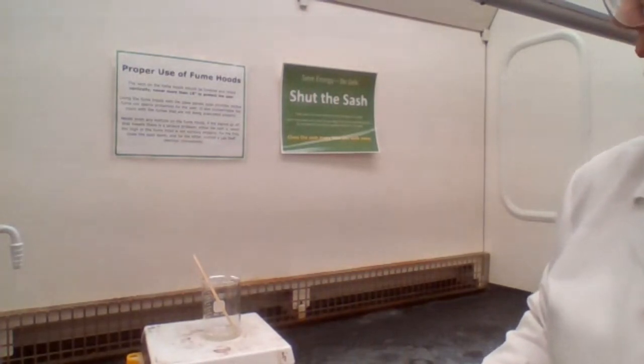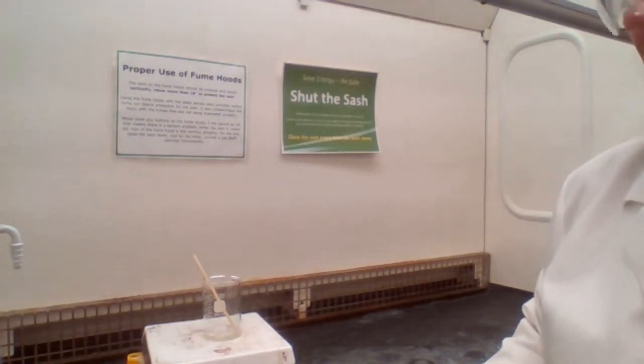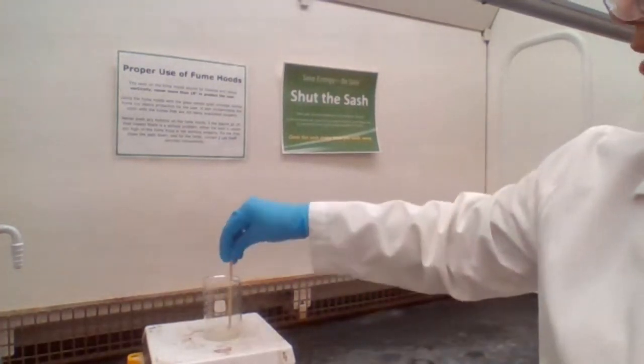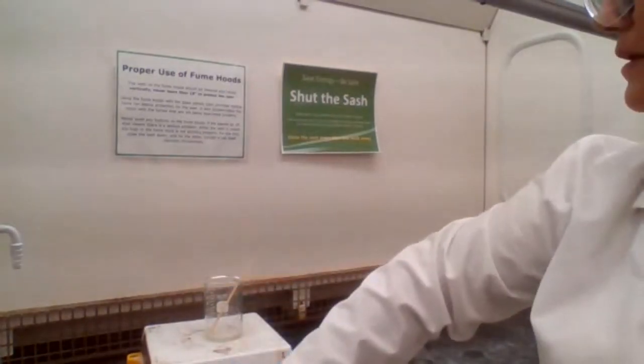Okay, it stopped boiling. We used 10 grams of benzoic acid, so it's going to be more than the 10 drops that I said. So it stopped boiling. I can stop the heat at this point.